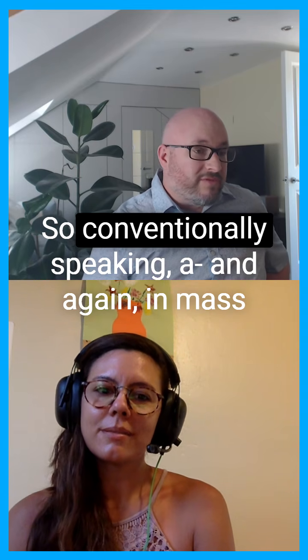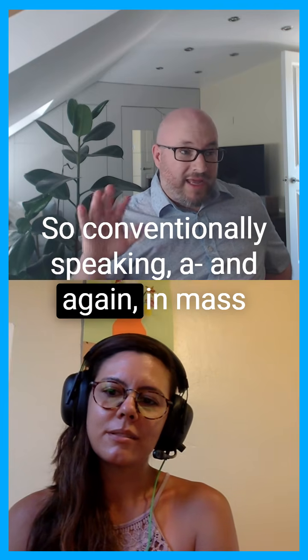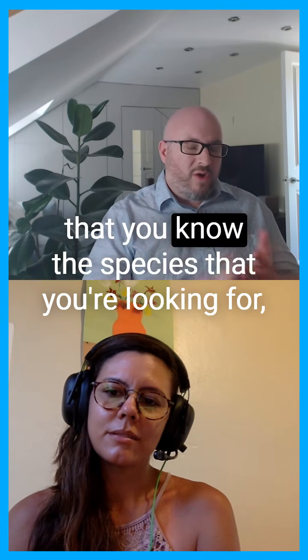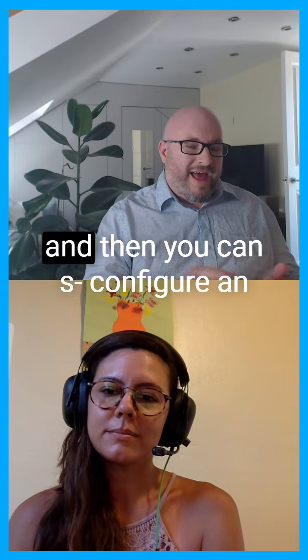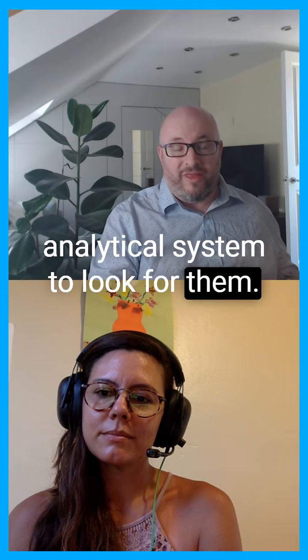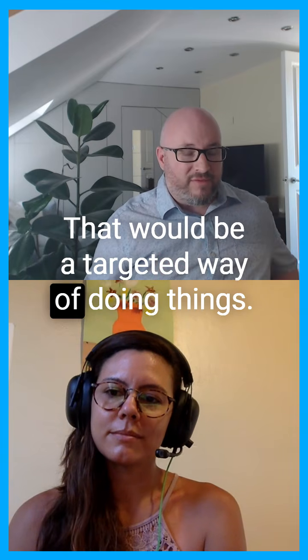Yeah. So conventionally speaking, in mass spectrometry terms, targeted would mean that you know the species that you're looking for, and then you can configure an analytical system to look for them. That would be a targeted way of doing things.